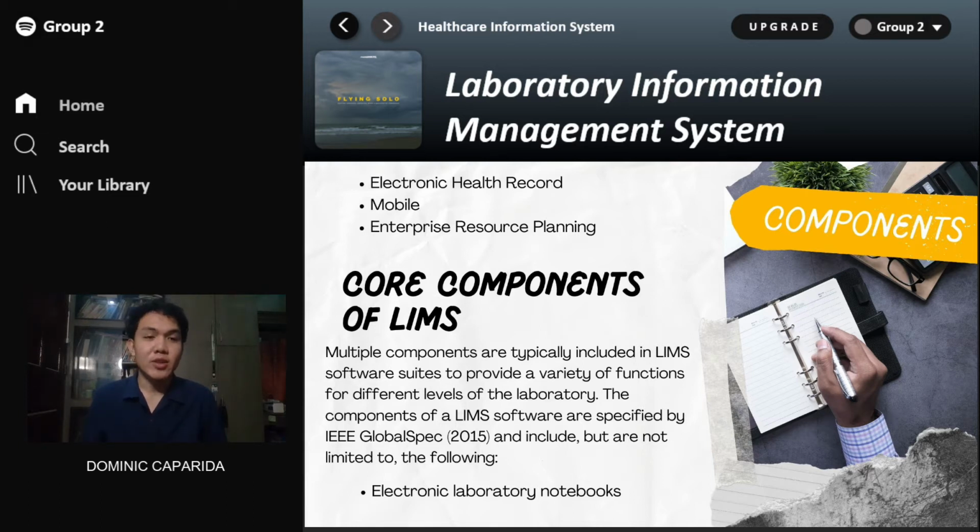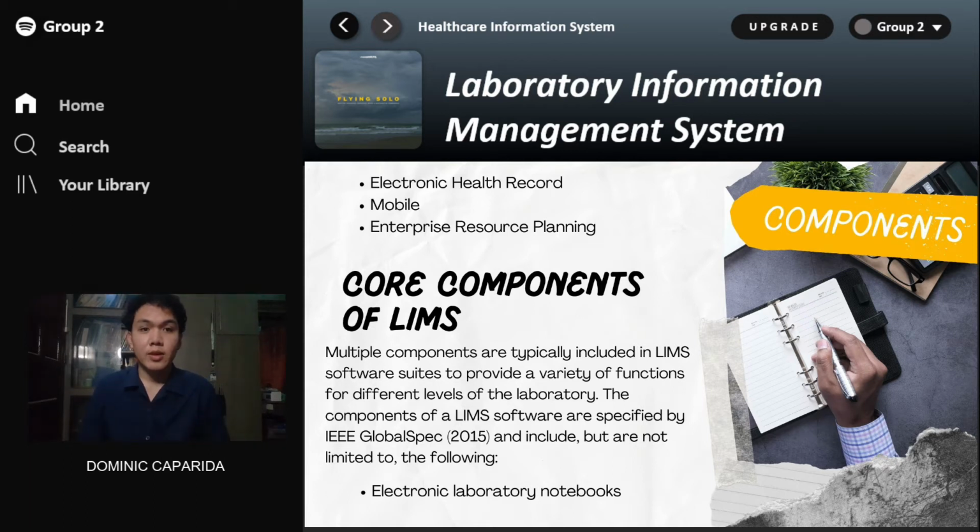It could include missing results, data errors, and differences in data collected can all exacerbate any error. These traditional means are not really reliable, and it's not credible to collect and store data this way. So that is why we have these laboratory information management system softwares to help us.